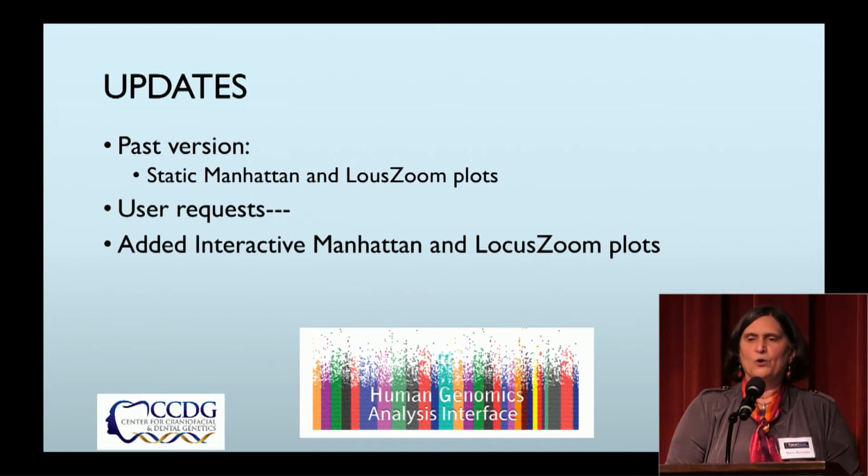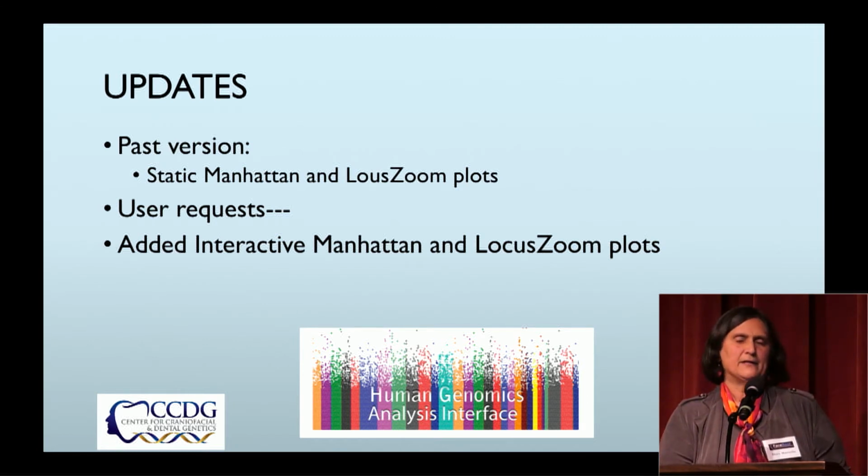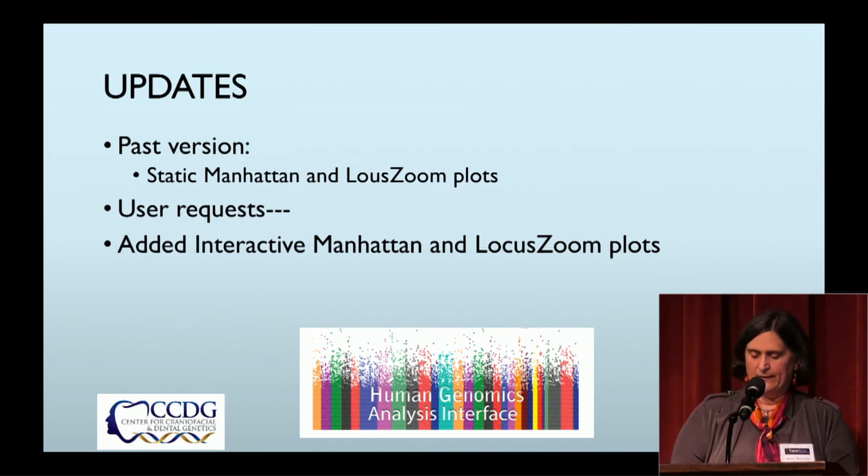So our goal over the last several months has been to add interactive Manhattan and locus zoom plots, again, leveraging methods that are already out there. We try not to reinvent the wheel. The University of Michigan, about the time we were hoping to do this, released an interactive version of locus zoom. So we wanted to use that. And then there are a number of R programs for interactive Manhattan plots, so we used one of those.